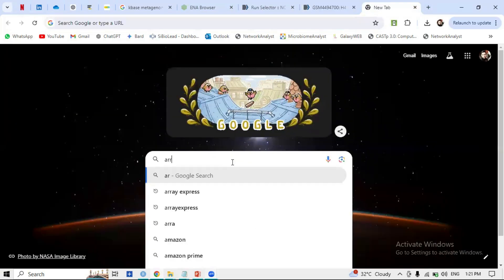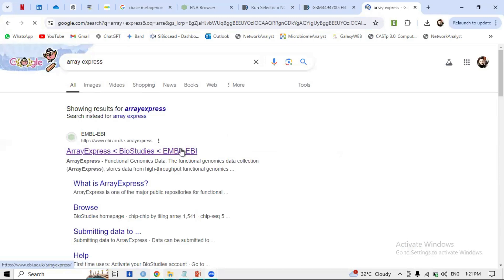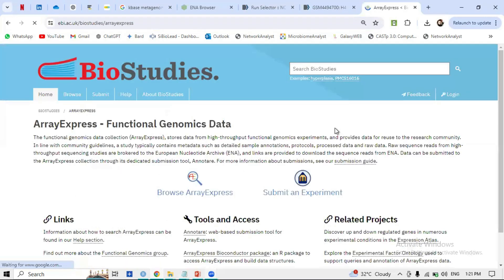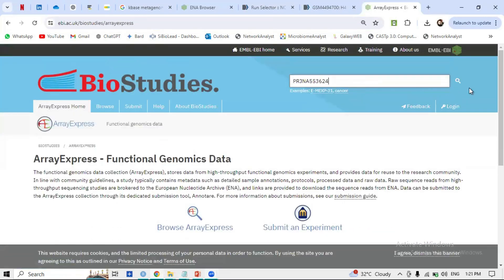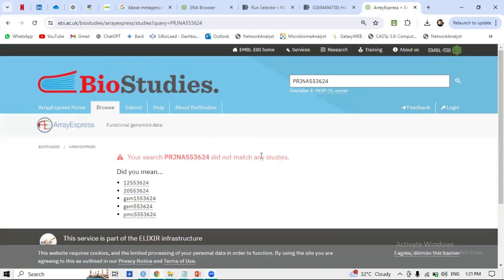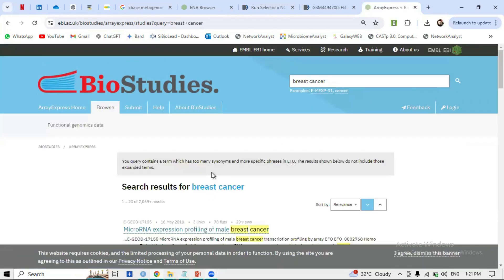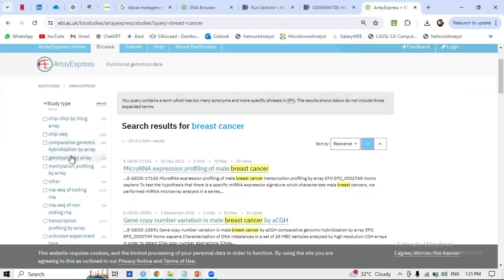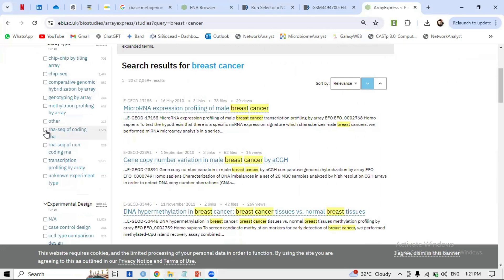Let's check whether ArrayExpress is integrated with ENA. Searching for the study in ArrayExpress — it's not present here for this particular study. However, NCBI and ENA are integrated. Let's search for 'breast cancer' in ArrayExpress and see what is present.